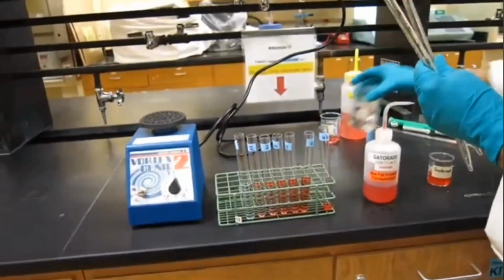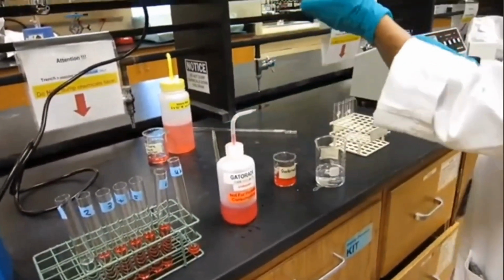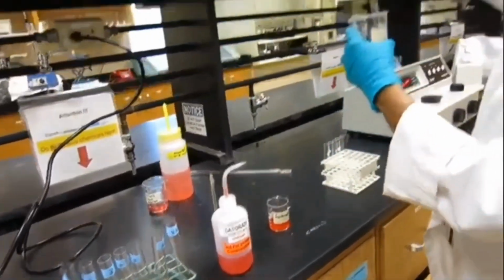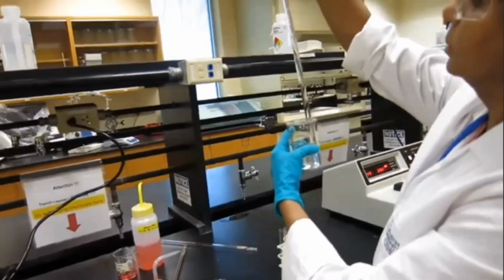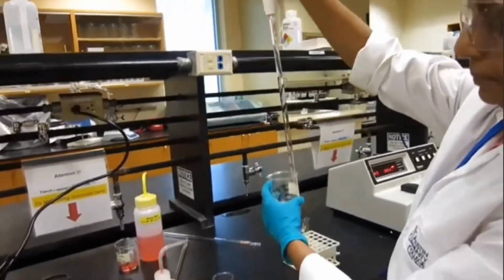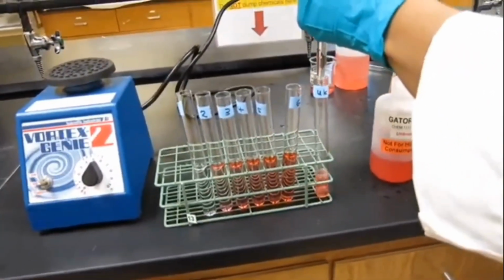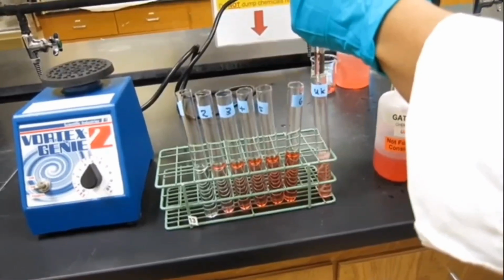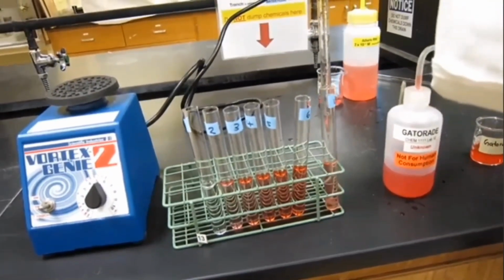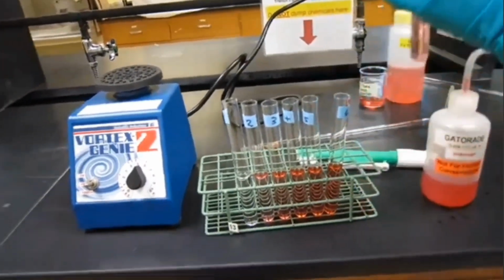Either 1 milliliter you take from the Gatorade and add 9 milliliters of water, or you can take 2 milliliters of your Gatorade and add 8 milliliters of water to make a diluted solution so that it can fall within the range where Beer's law operates. So that also is going to be 10 milliliters.